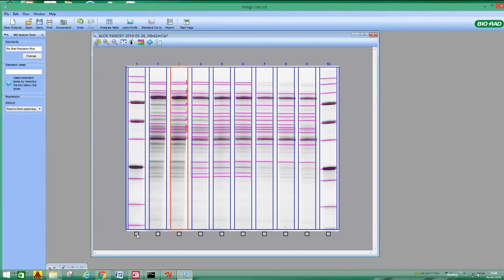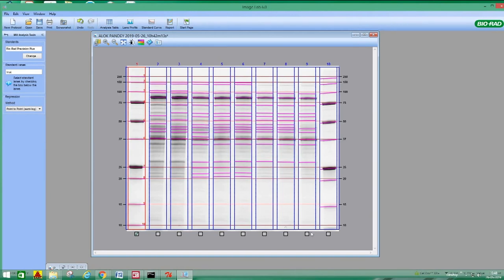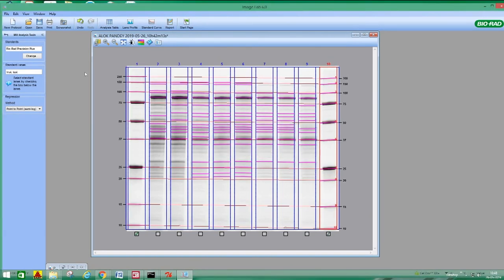Here the tricky part is you have to select the lane in which you have loaded the molecular weight marker. So I am selecting the first lane and the last lane. It automatically came. So if you are using your gel of interest, you need not worry, you just have to give your molecular weights.